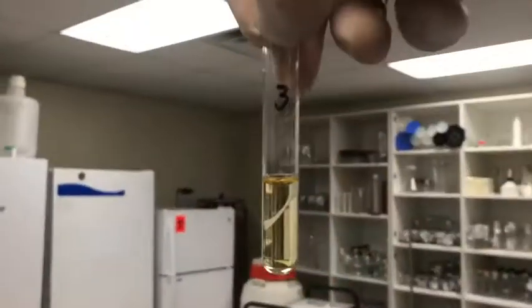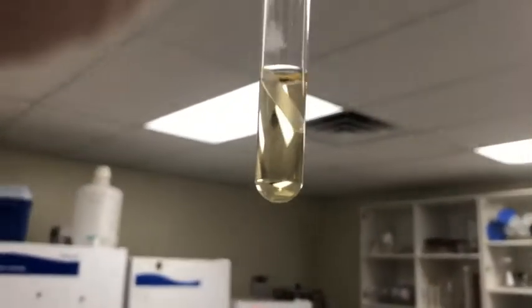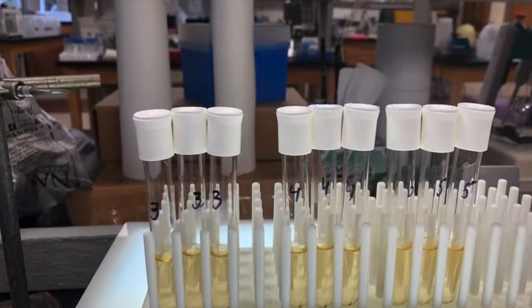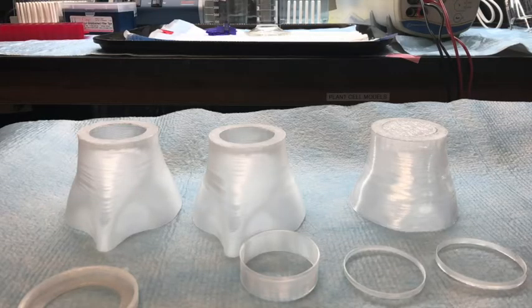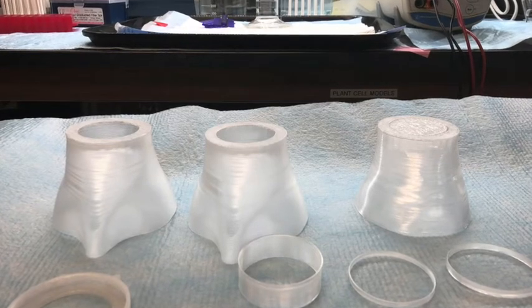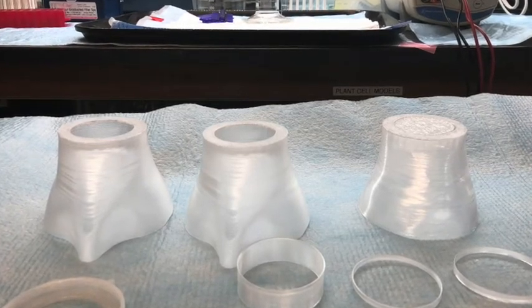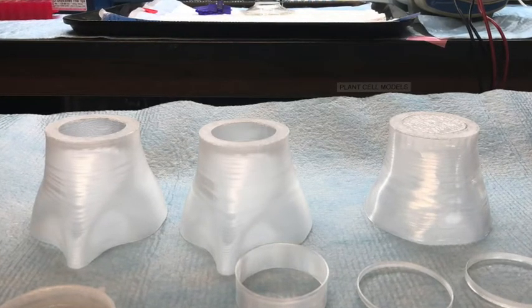So after shaking in the incubator, what I found when I came in the next morning was no growth in any sample, which suggests that sanitization and sterilization works. You can see that a little bit better here. So there was no growth whatsoever. Recall here, the overall goal is to determine the extent to which these 3D printed masks are autoclavable, and they are. Even more important, they're sanitizable. And no autoclaving is actually necessary.